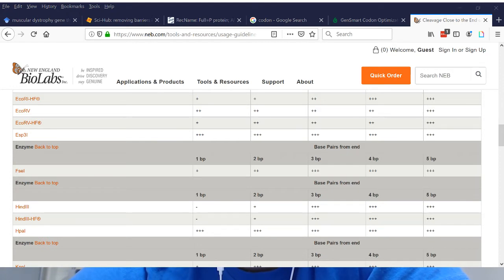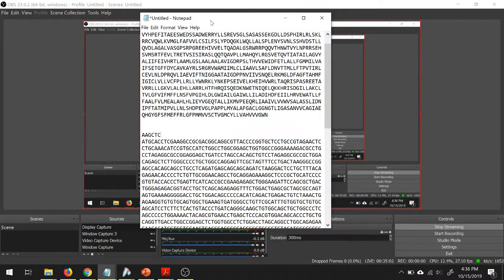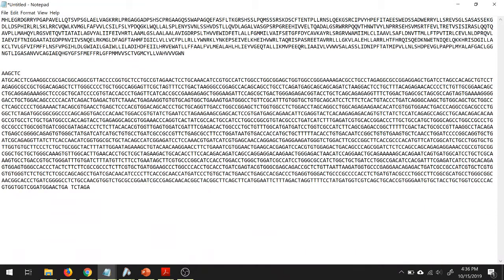So what we can do is, let's see, we can go to our sequence. And so we have the restriction enzyme sites. Then what we also want to do is just add in 6 bases. So GCTGAC. And on this side, it doesn't matter, again, just 6 bases, GAATCG. All right, so we got our sequence now.